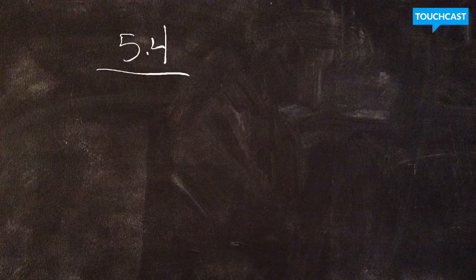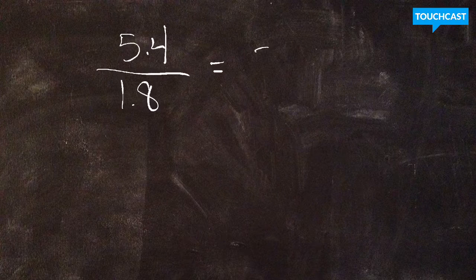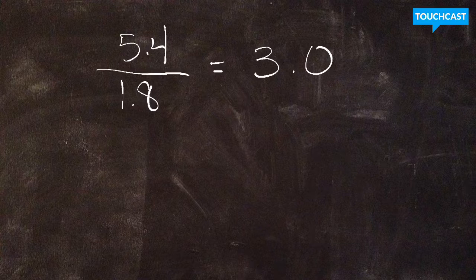We don't have any separation factors that are less than the value of 1, okay? So we're going to put the larger factor on top. Look back at part C. The blue dye had a factor of 5.4, and the red had a factor of 1.8. All right, and this gives you a separation factor, or selectivity separation factor, of 3.0. That means you had a pretty good, effective separation.